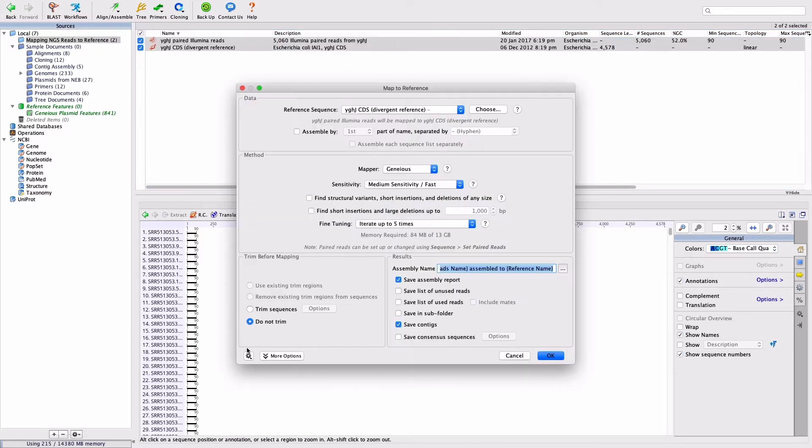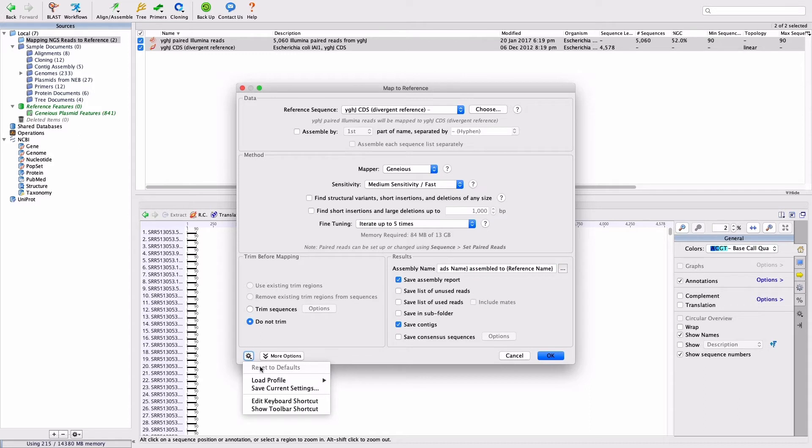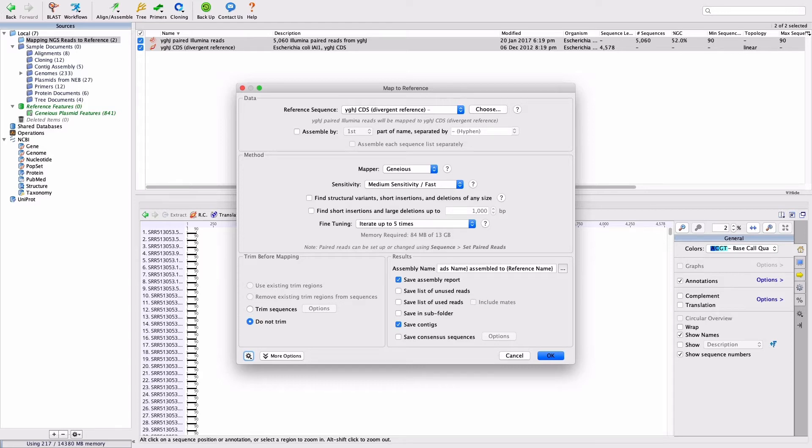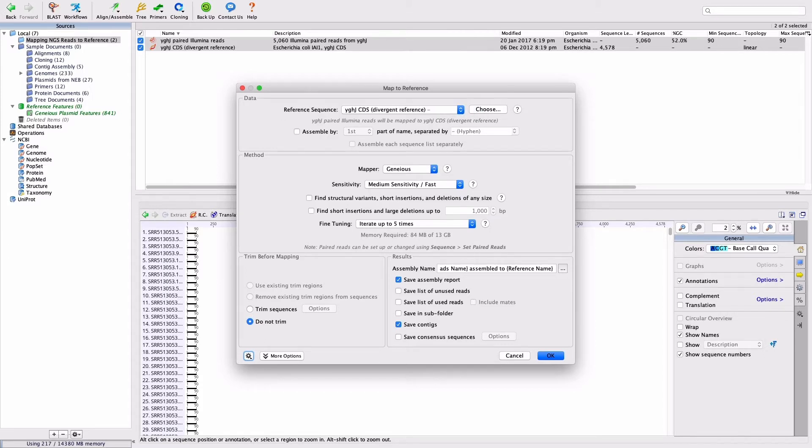Reset to the default settings using the gear at the bottom left of the window. Genius Prime will guess which of the sequences you have selected as the reference, but you can change this using the drop-down menu. In this case, it is chosen correctly, and YGHJ CDS Divergent Reference should be chosen as the reference sequence.